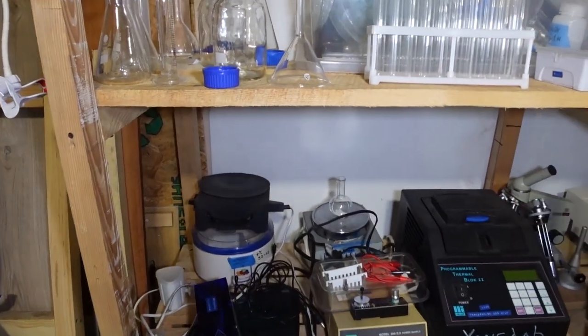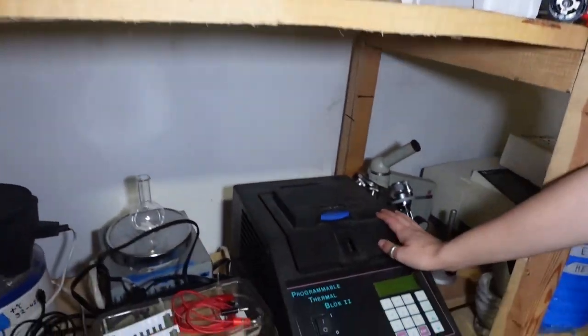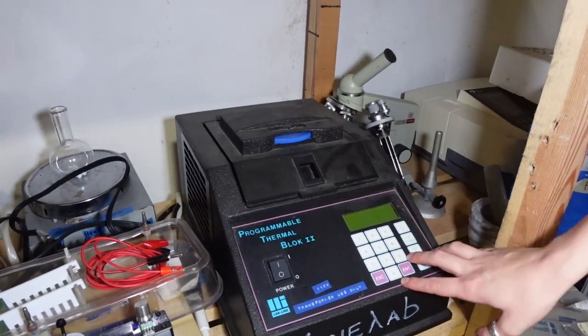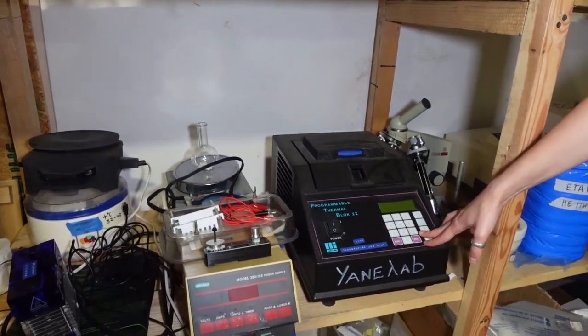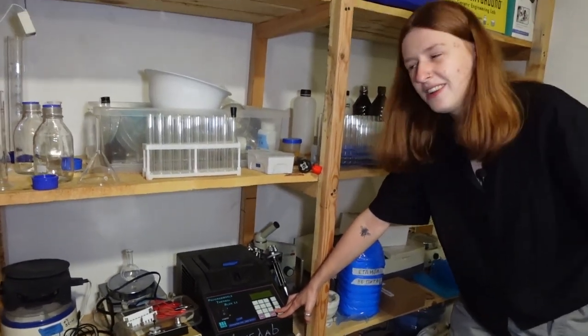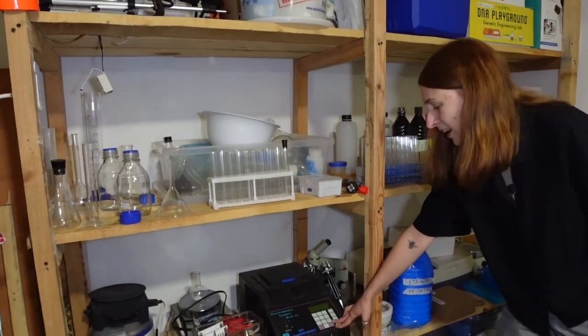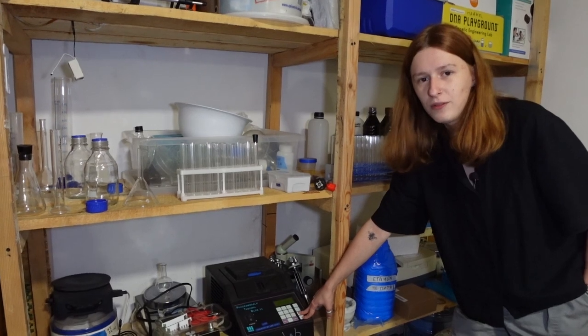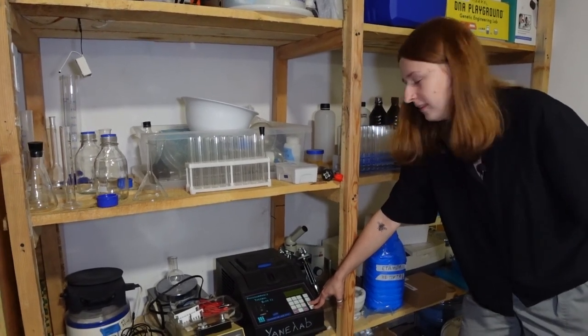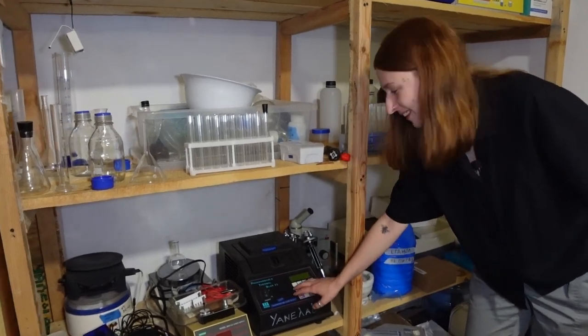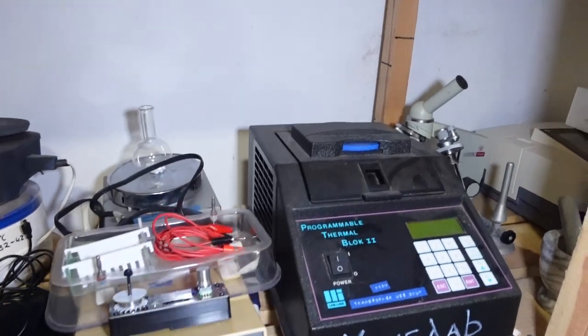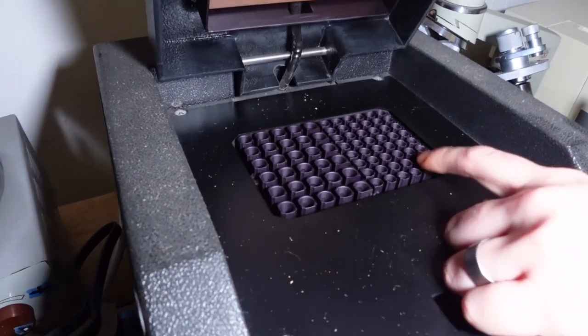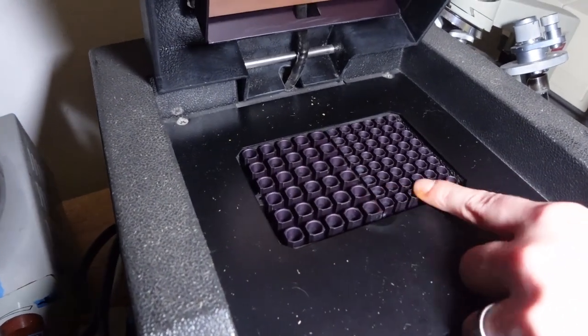Here we have equipment. I have three PCR machines. This is the first one I got. It's really old, it's covered in dust but I keep it. It's the first PCR machine I bought and I was very proud of it. It's not a bad PCR machine but it's super heavy, super hard to use. It's 110 volts so I had to use a transformer because we have 220 volt outlets. But it was literally made in the 80s and I just like the aesthetic.